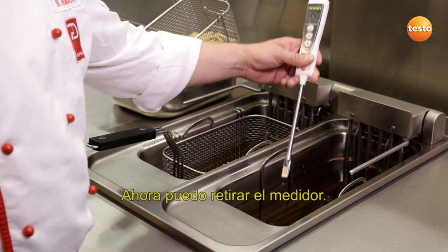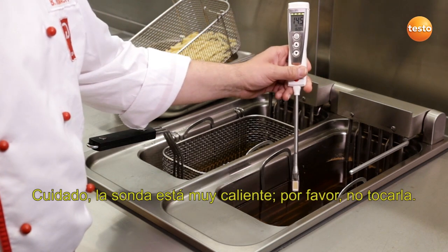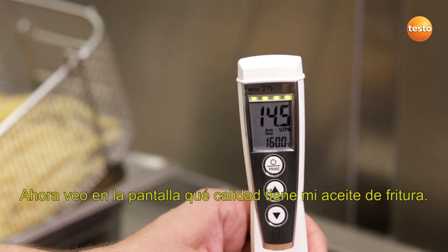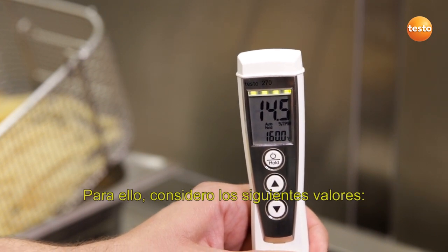Now I can remove the instrument again. Careful, the probe is very hot, so please don't touch it. And I can now see the quality of my cooking oil in the display. The following measurement values are important.